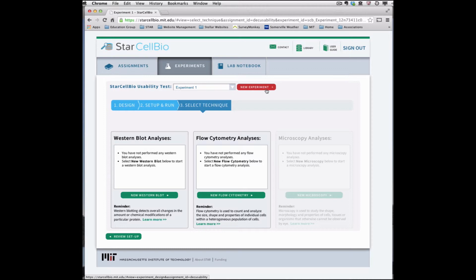On the Select Technique page, you will see the 3 experimental techniques, Western blotting, flow cytometry, and microscopy, which are available within StarCellBio. Not all experimental techniques may be available to you to complete your particular assignment. In this assignment, microscopy is not available. For the rest of this video tutorial, we will focus on the Western blotting experimental technique.